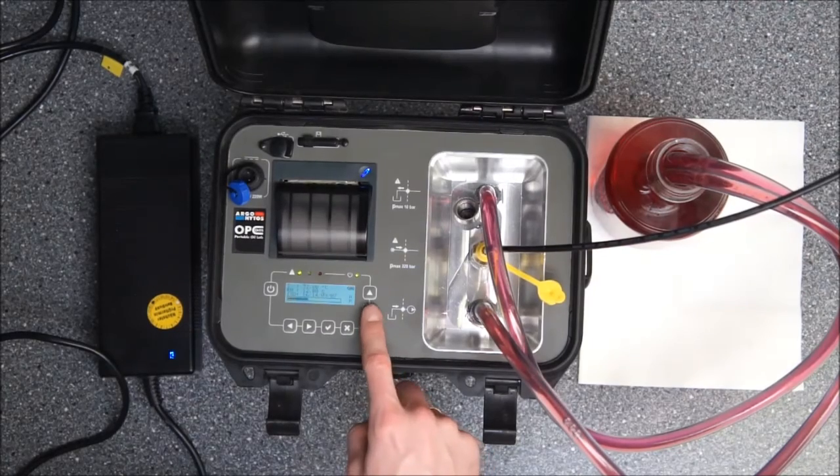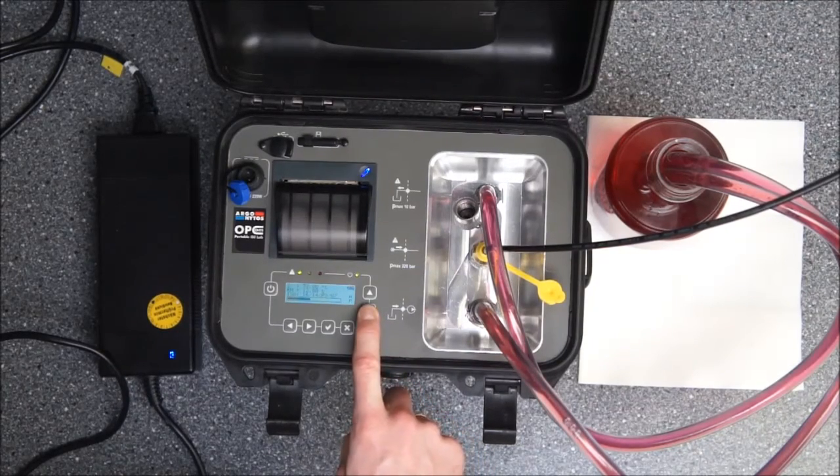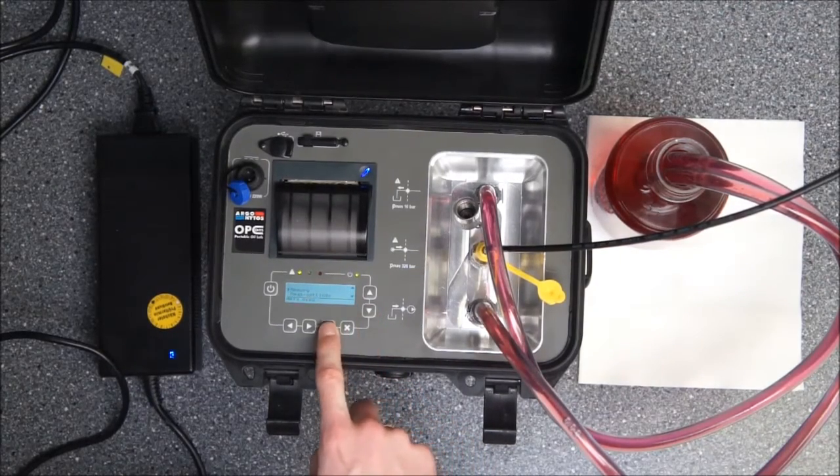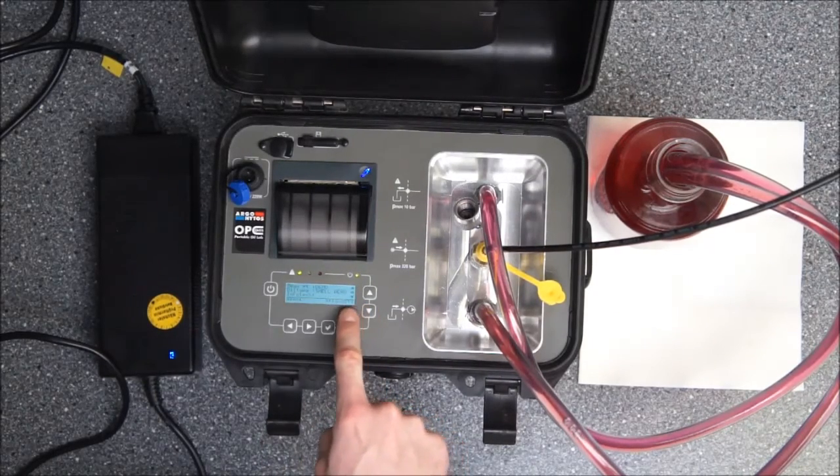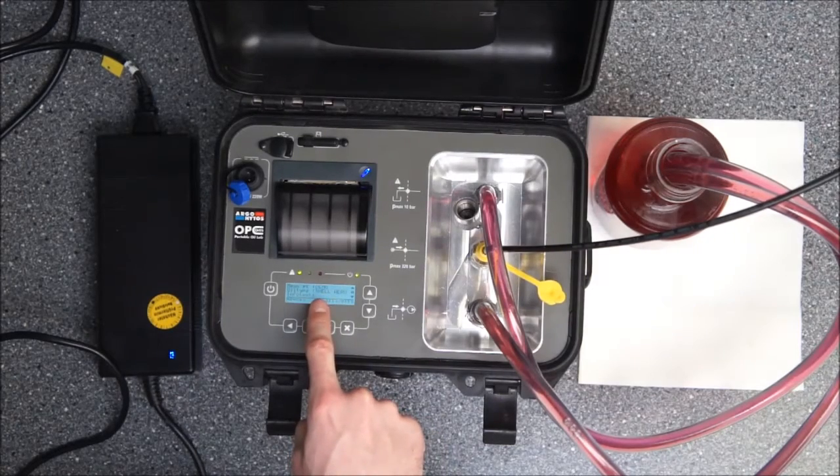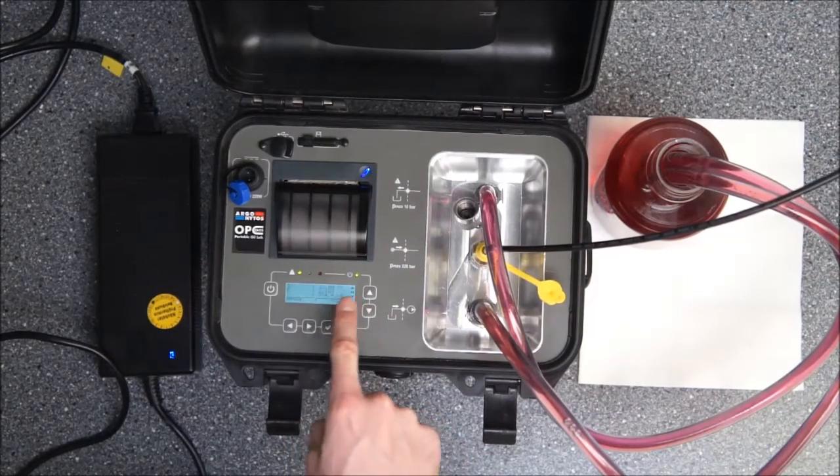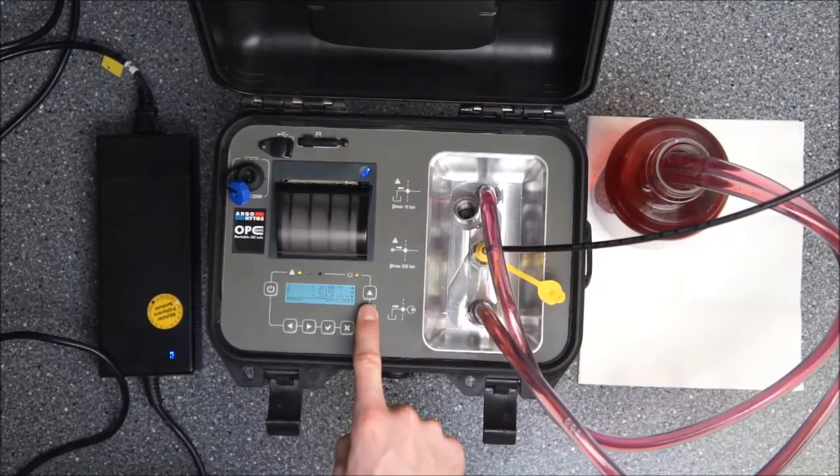We will now one time more just look at the menu and look at the data that we have measured in the memory. And you can see this is the last measurement that we have taken also with the indication of which measurement point it has been and also the oil type. And you will see all the readings of the measurement that we have done.